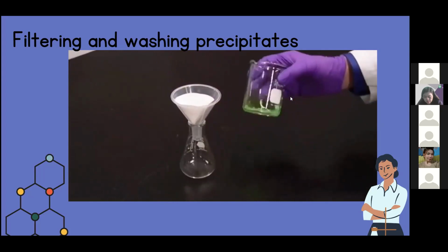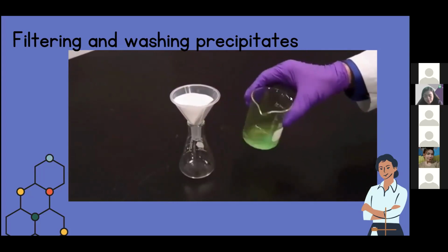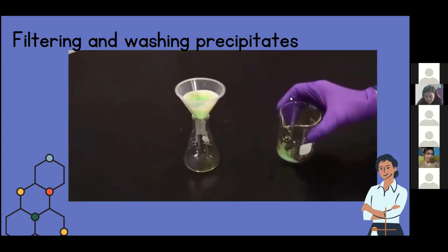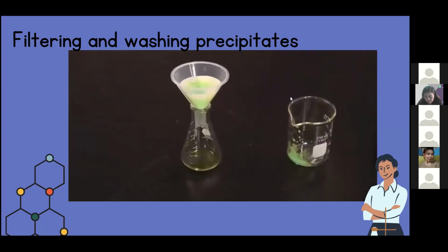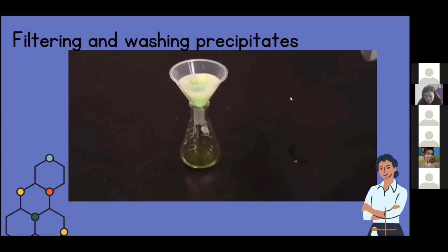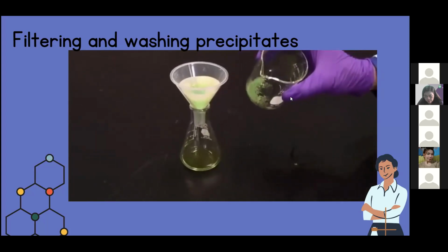Take your mixture of solid and liquid and swirl it to suspend the solid in the liquid, and pour. Be careful when you're pouring that you don't overtop the liquid as it goes through, otherwise it'll just run down the outside of the filter paper and it won't be much use. You may need to take a break and pour some more if you have too much.